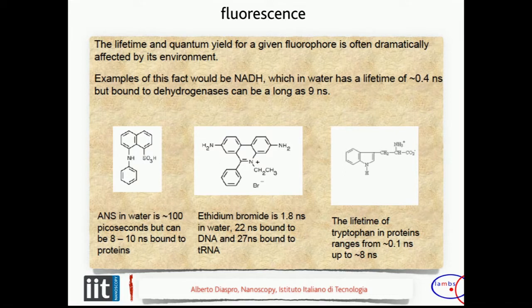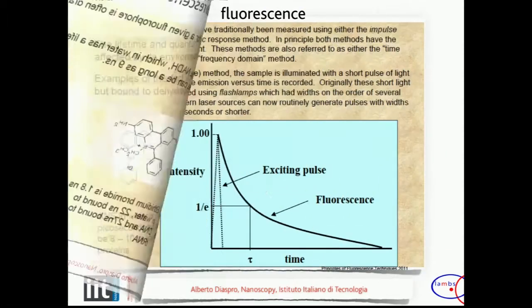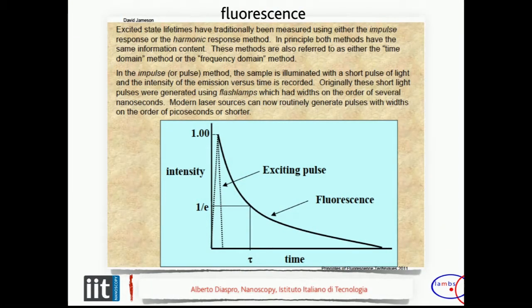Then you move into the cell, and in the cell, you are not able to control anything. That is a free running for your molecules. So again, you can measure in this way.